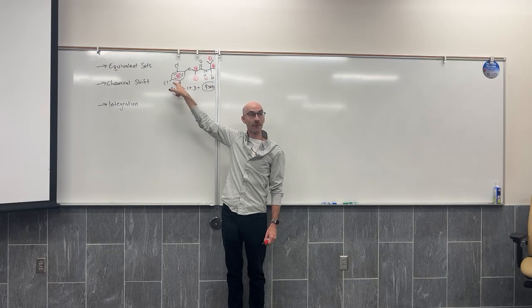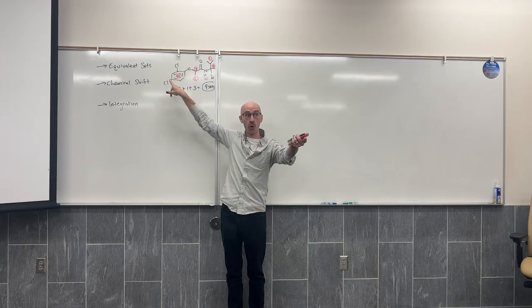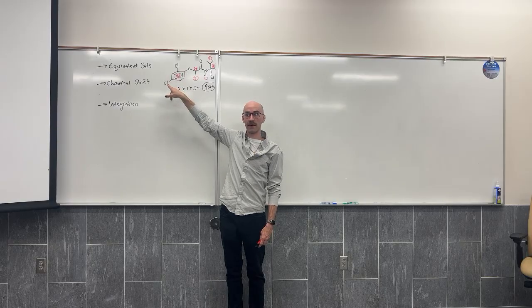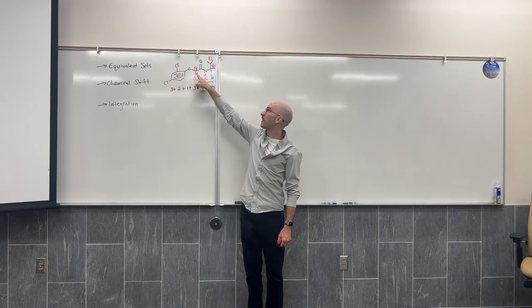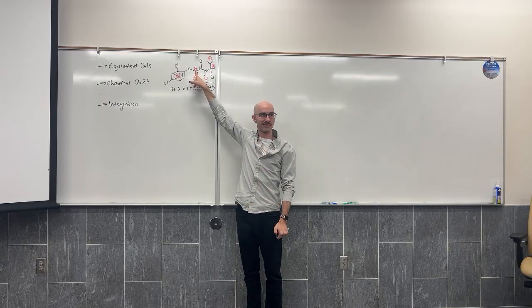I can't do it. Isn't that wild? These hydrogens bonded to carbon are further to the left, meaning more de-shielded and more exposed to the magnetic field than the hydrogen that's both adjacent to an oxygen and a carbonyl.